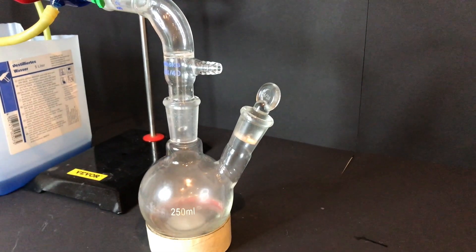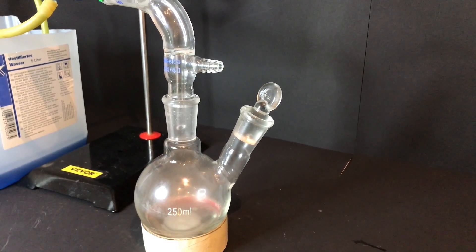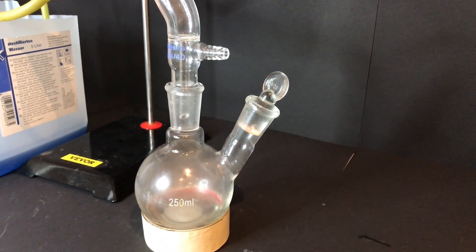After some time the powder mixture melted and some cyclopentanone and water was coming over. Some adipic acid sublimed as well and it shattered at the bottom of the receiving flask — you can see it there.